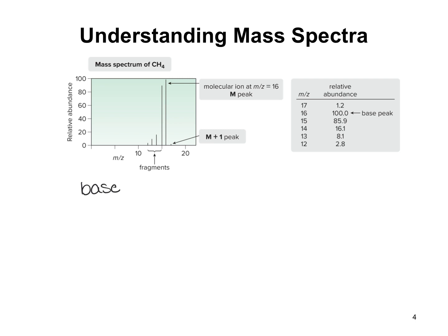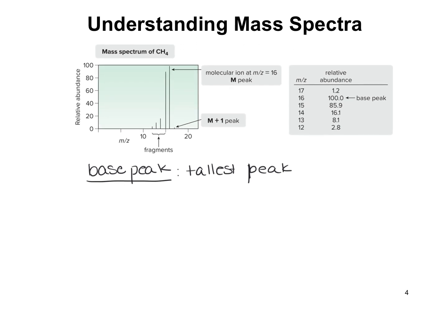So the base peak is the tallest peak. And then we also will notice we have a molecular ion peak.